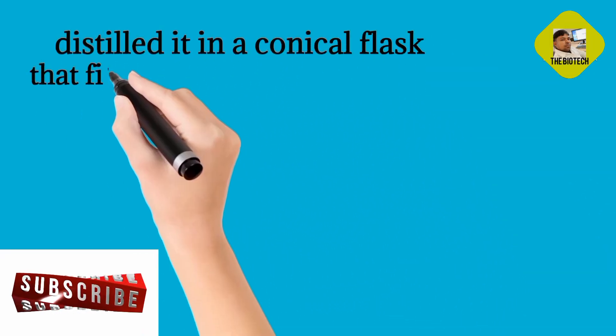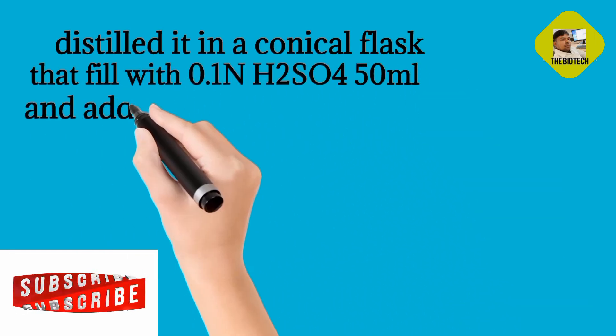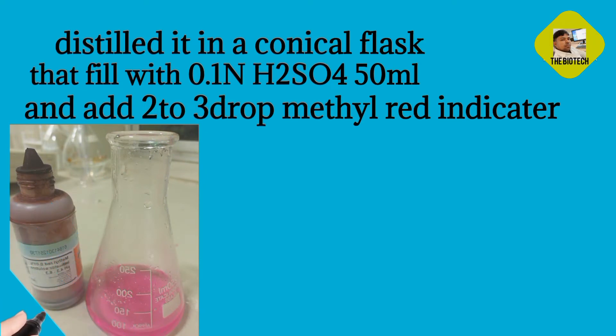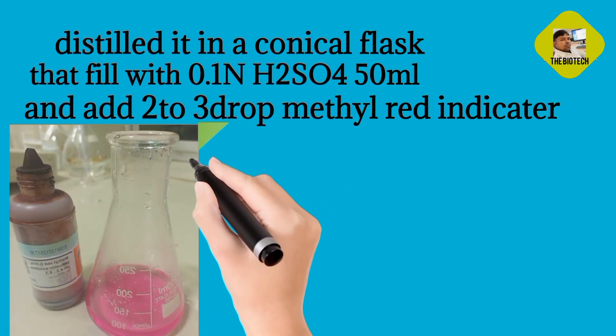Distill it into a conical flask filled with 0.1 N H2SO4, 50 ml. Add 2 to 3 drops of methyl red indicator.